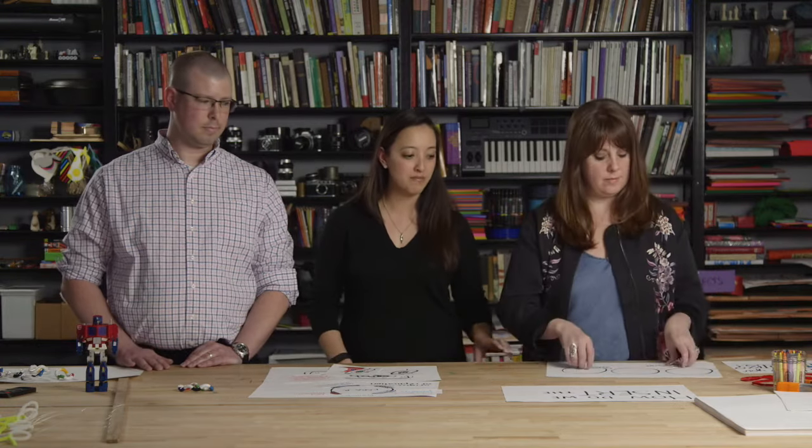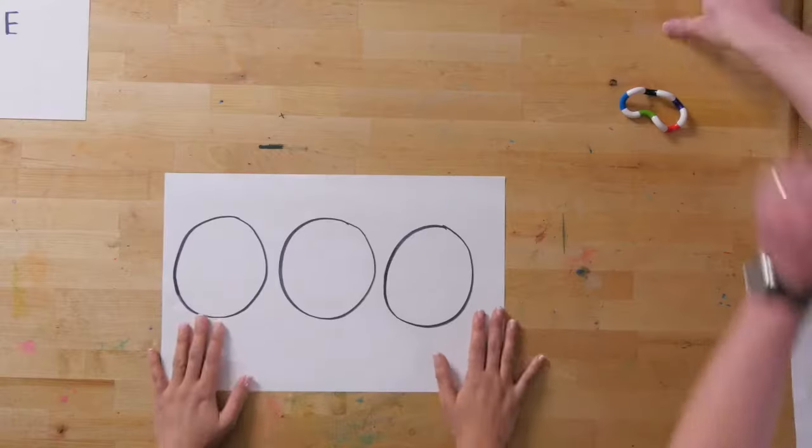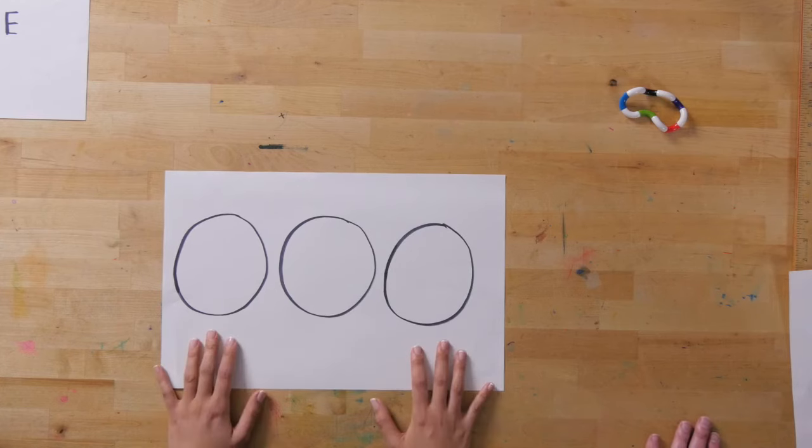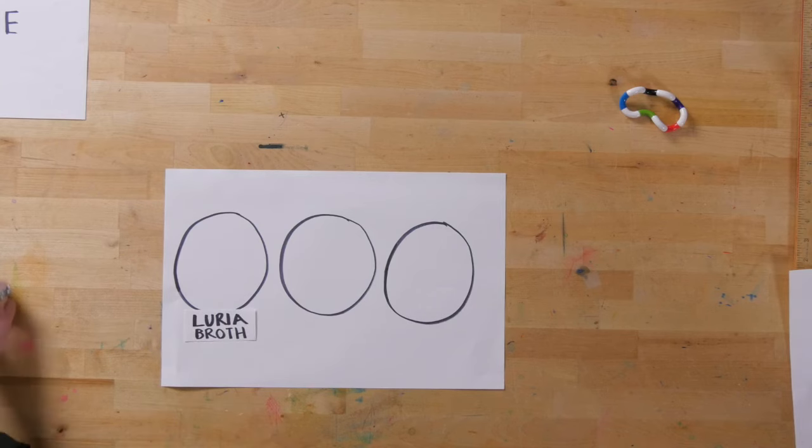These may just look like circles, but they represent plastic dishes called petri dishes that we can fill with different medium or food. Luria broth is bacteria's food of choice. This is like a big buffet for E. coli.